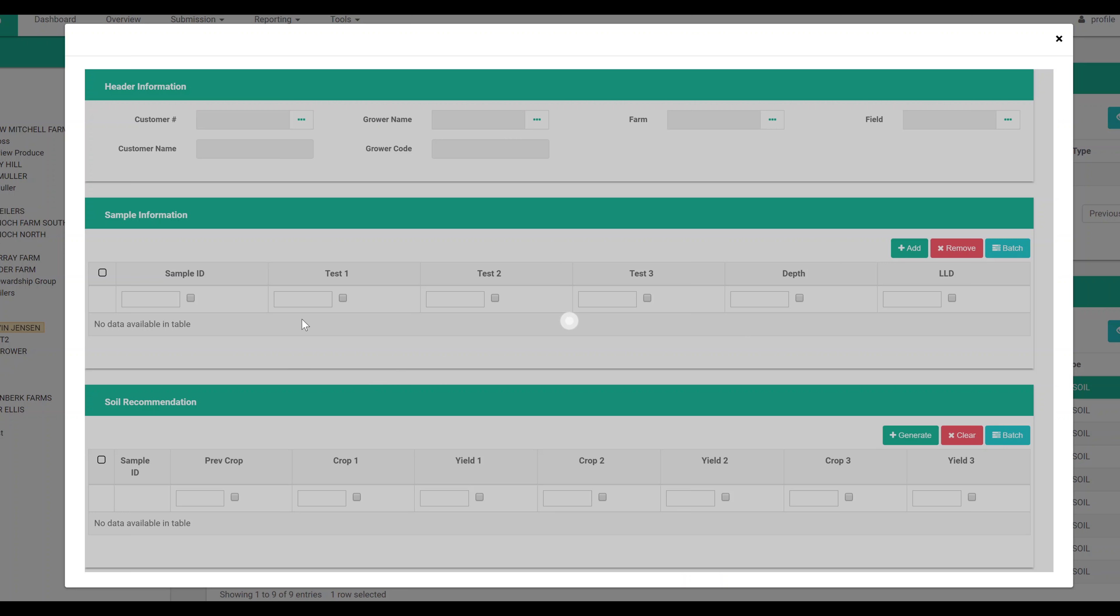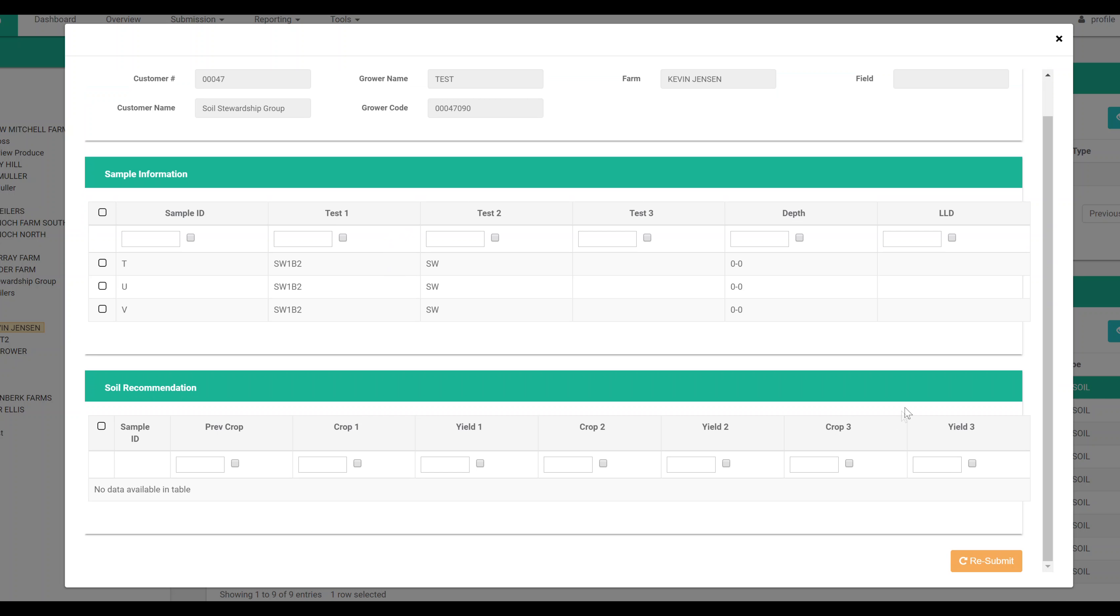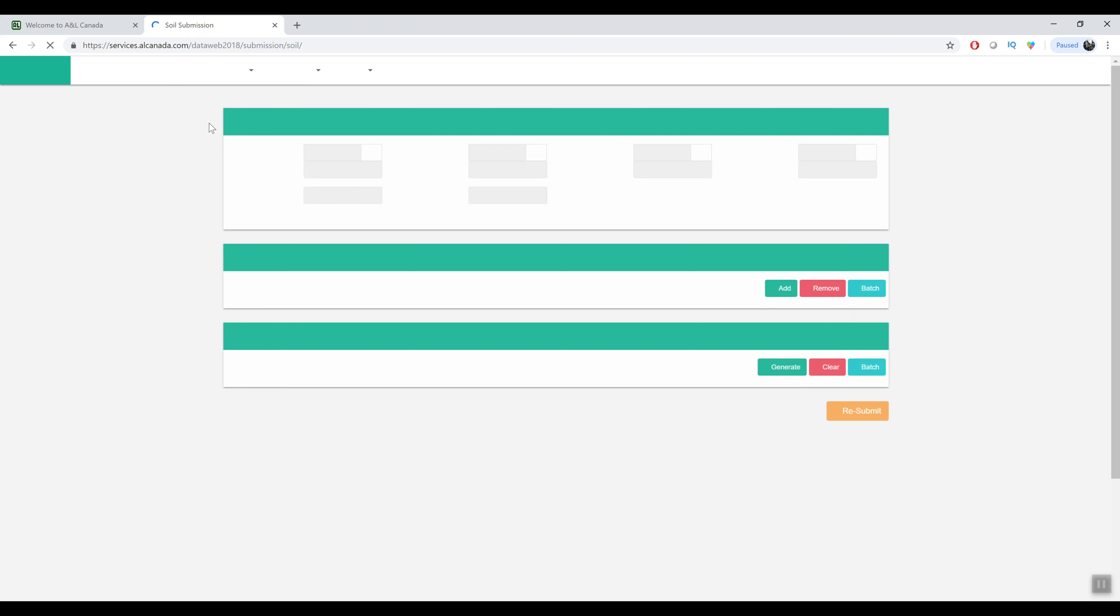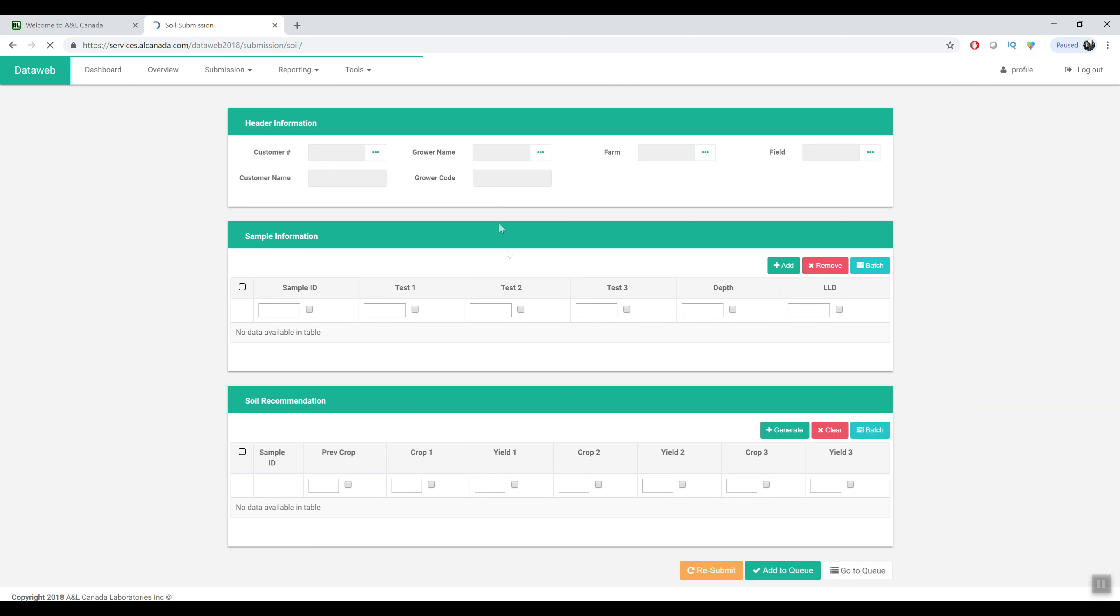You can view the submission. You can edit it if it needs to be edited and you can also resubmit the submission from here. So this is just basically an overview of the system. We'll be doing some more in-depth videos on the different modules but this just gives you a brief overview.